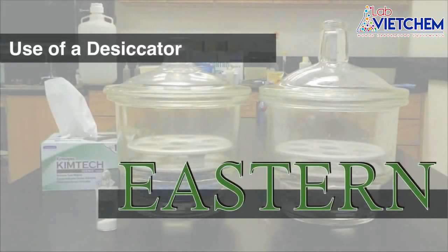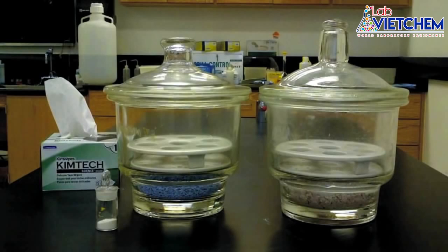Okay, so this video will show you how to use a desiccator, so listen up. Here's what you need.